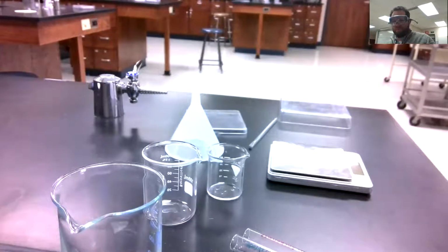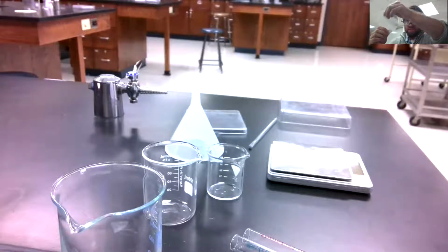First step, so we're going to take our filter paper, excuse me. This usually looks like a circle, and we're going to fold it in half. So you've got a half circle there, half moon. And then we're going to fold it again. So you almost have a triangle here. So fold it into quarters.